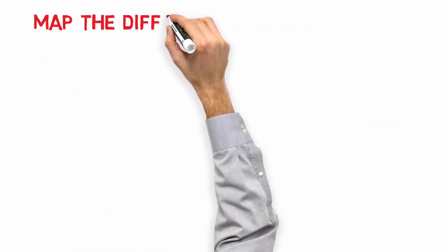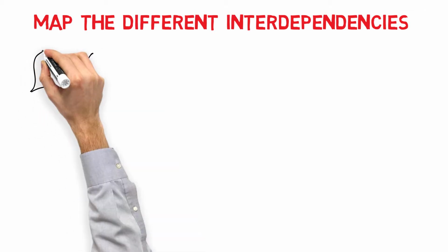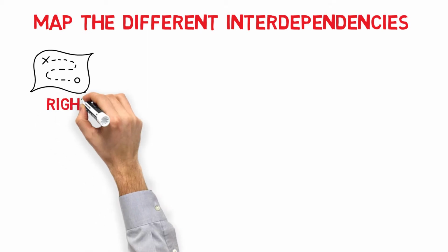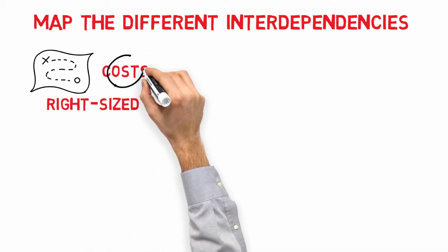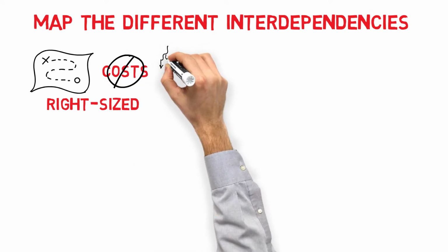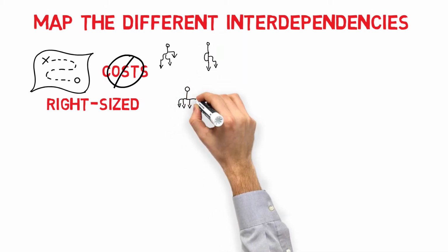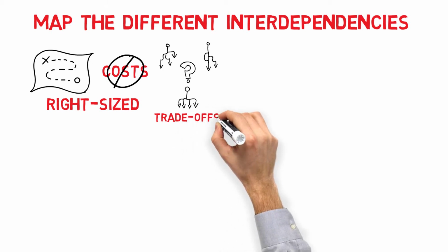It is important for you to map the different interdependencies amongst the upstream and downstream unit operations so that the harvest and clarification operations can be right-sized to build an optimized process without wasted capacity and incurring additional costs. Even with a clear map of your project needs, selecting the right set of unit operations to meet those needs can be difficult, as many of the options being used today may come with some trade-offs.